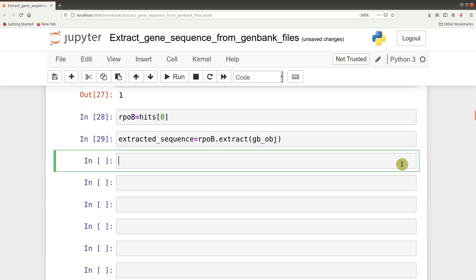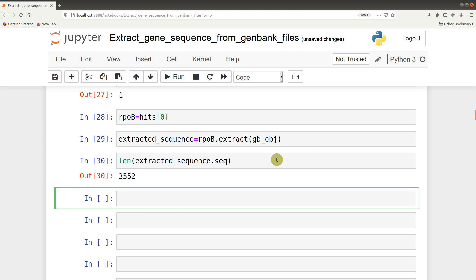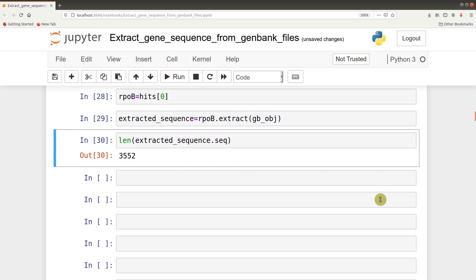We can say len extracted_sequence.seq - that should give us the length. This is the length of that particular gene, which is 3KB.